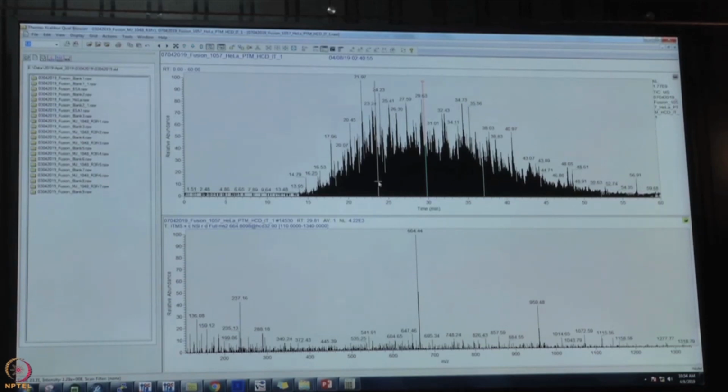Further, based on the abundance of each of these peptides, they are fragmented at the MS2 level and detected. It is to be noted that most of the peptides which are less abundant are likely to be ignored, and only the highly abundant peptides get fragmented.